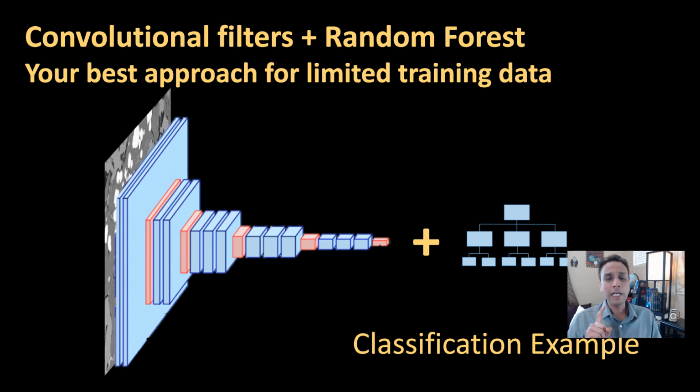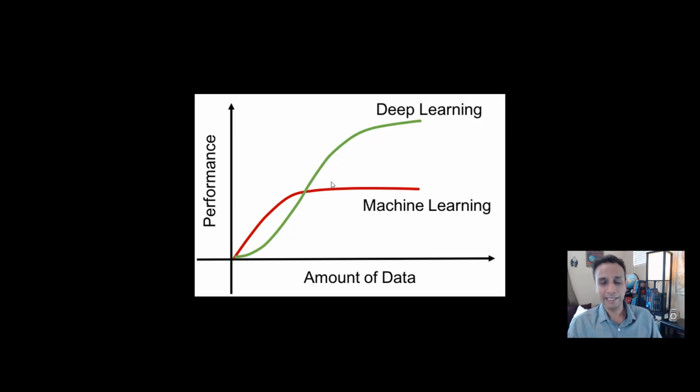Again, you'll soon realize that this is not just for microscopists, this is for anyone interested in data or image analysis. Until now, I covered traditional machine learning and quite a bit of deep learning, but in this video, I'd like to combine the best of both worlds to create a solution that works amazingly well, especially when you have limited training data.